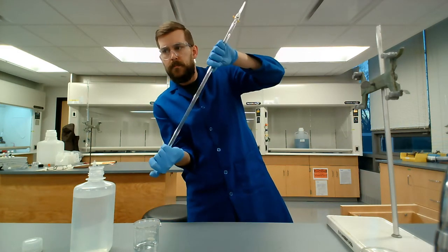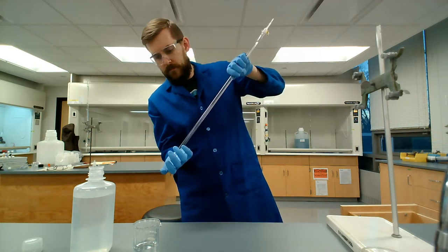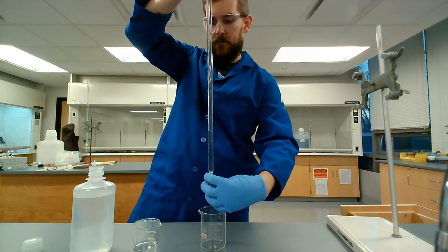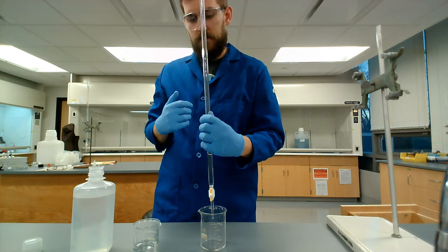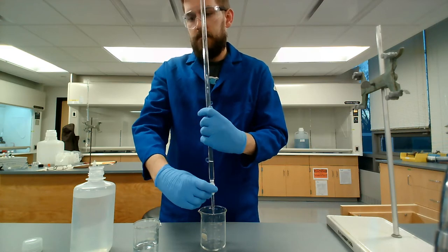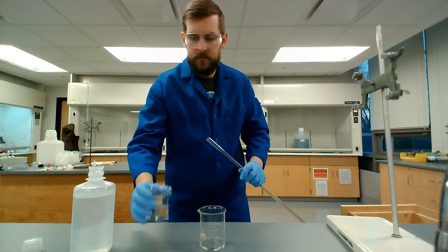It previously had water in it, so I need to rinse and condition it with the solution that I'm putting into it, right? Part of our goal in this experiment is to standardize, or figure out the concentration of, this sodium hydroxide solution. What's in the buret needs to be the same concentration as what's in that big plastic bottle. So I'm rinsing the buret 1 or 2 times with the sodium hydroxide. Again, draining it takes a bit, so I'm just draining some through because there was water in the tip, and I want to make sure there's sodium hydroxide in the tip. Then I'm inverting it again.